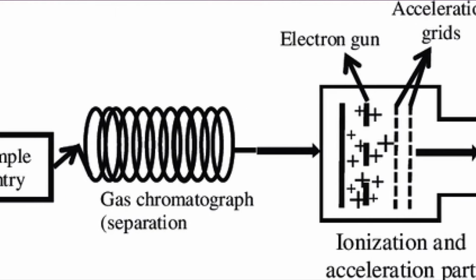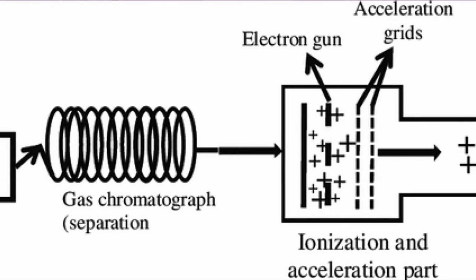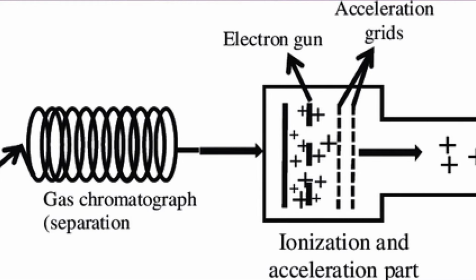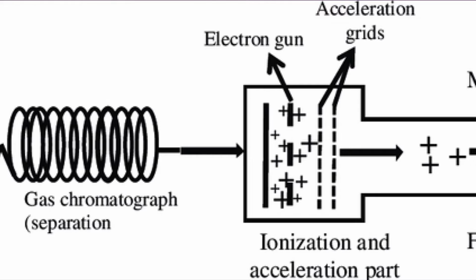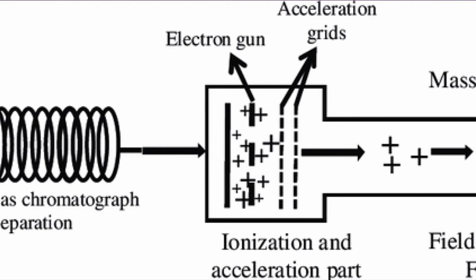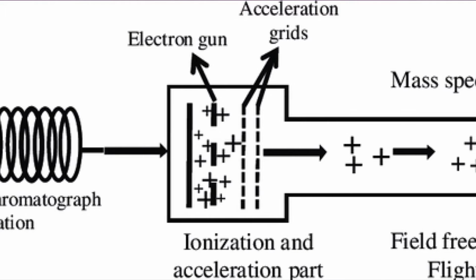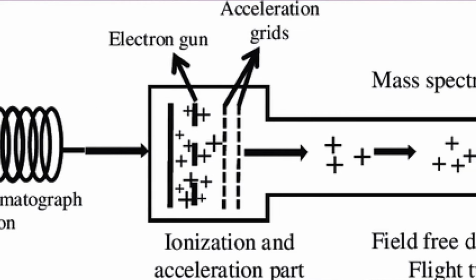The second process I'm going to be discussing is mass spectrometry. The process works by first bombarding the substance with electrons to knock off one of the electrons in the substance's outer shell, making a positive ion. This process is called ionization. These ions can then be accelerated by introducing a negative electrical field, due to the positive ions being attracted to the negative electric field like magnets are to metal.